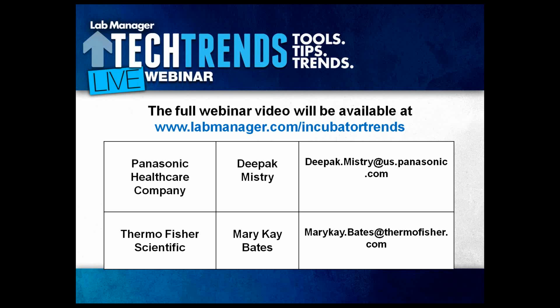But what should be important to a researcher is to find out specifically from the manufacturer on testing that they've done for their exact copper that they have in their incubator, and show the effectiveness of it against mycoplasma and other types of species. From our standpoint, UV does work on mycoplasma. We have enough data on that, as well as H2O2.